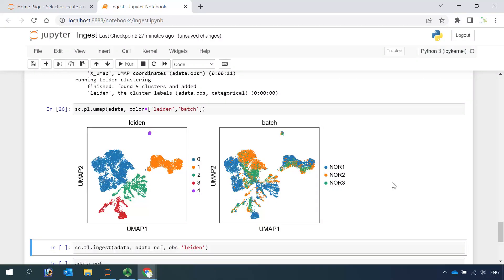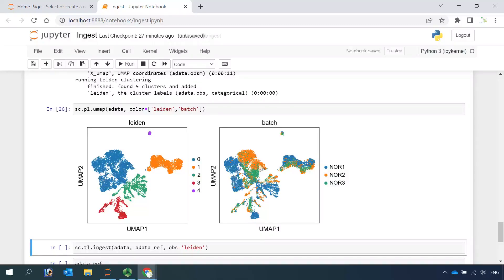If we look at the cell colors from the different batches, we can see there are batch effects among the three different datasets. The colors for cells from different datasets — orange, green, and blue — are not integrated very well for the same cell clusters. Also the shape of the cell clusters is different from the reference dataset.